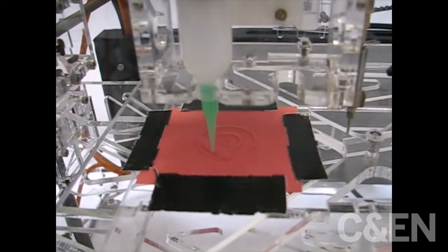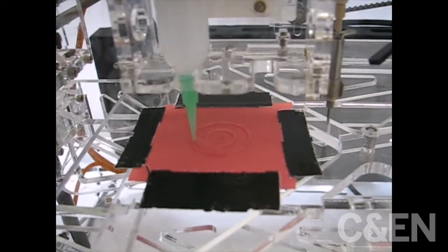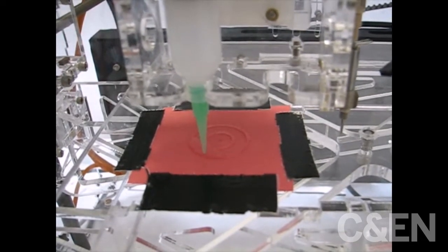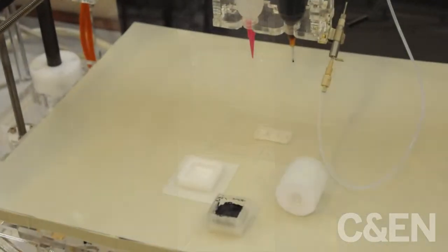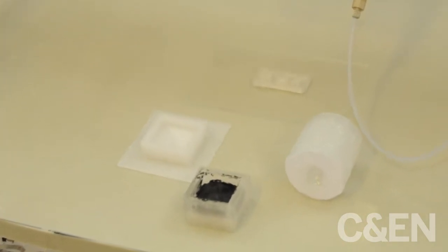Cronin and his team constructed their own 3D printer, which uses syringes to extrude materials during fabrication. The researchers manufacture their chemical reactors with a fast-curing acetoxy silicone.